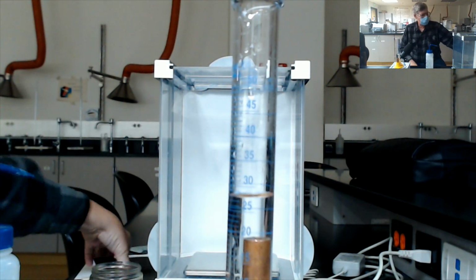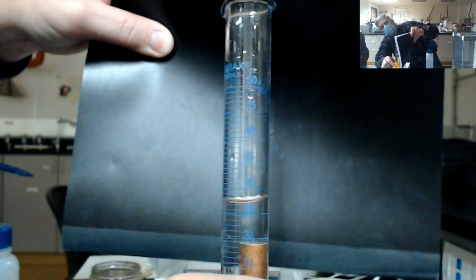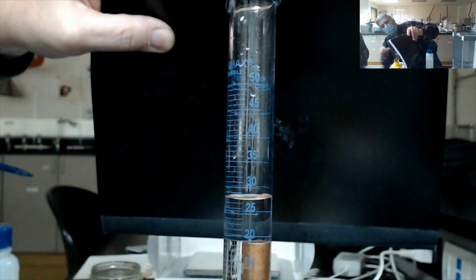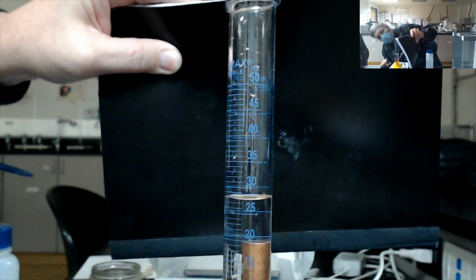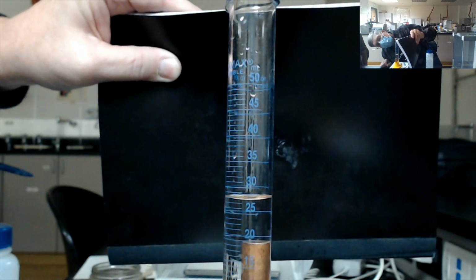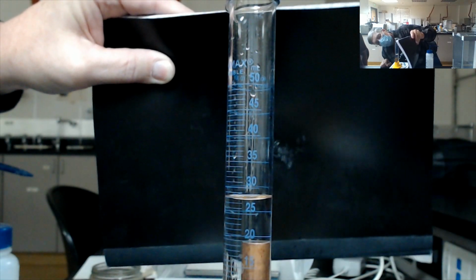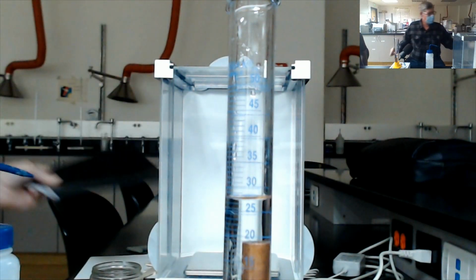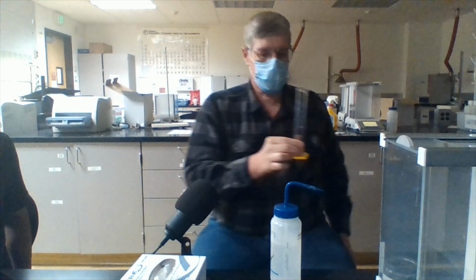On this measurement, we'll bring in our black again. We'll turn it so you can see it, and hopefully the glare goes away. But we're almost to 27, just a little under, so we'll record this at 26.8 milliliters. So the difference of those two volumes is the volume of metal cylinder 1.